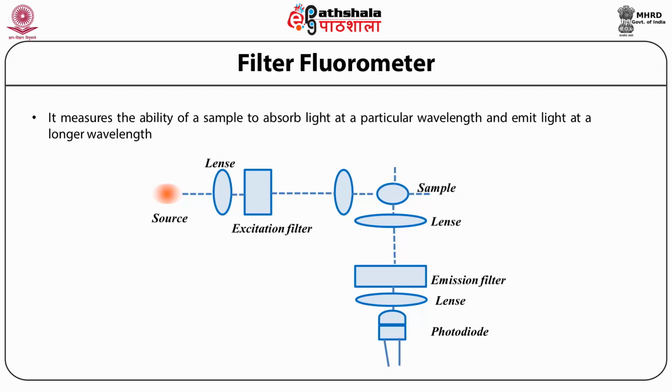A typical fluorometer includes a light source, a specimen chamber with integrated optical components and high sensitivity detectors, and the schematic diagram of the arrangements are shown in the figure.